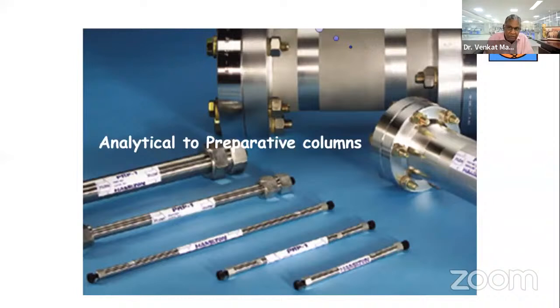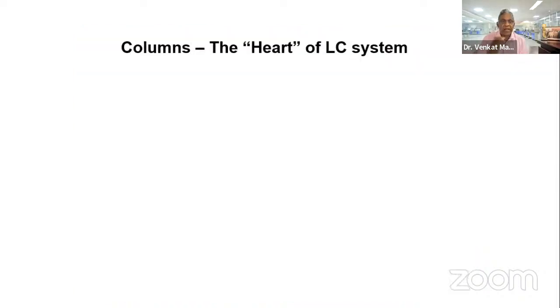Over the last 4.5 decades, I have used the column as small as this column, as big as this column, for various kinds of applications. In this entire system, the column is the one which provides the separation for various kinds of components.